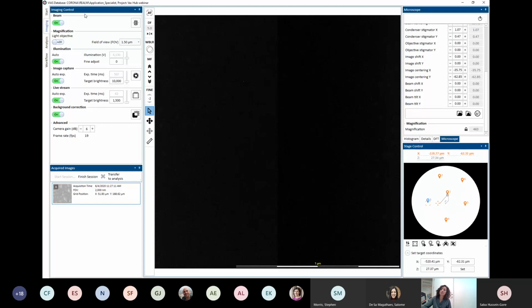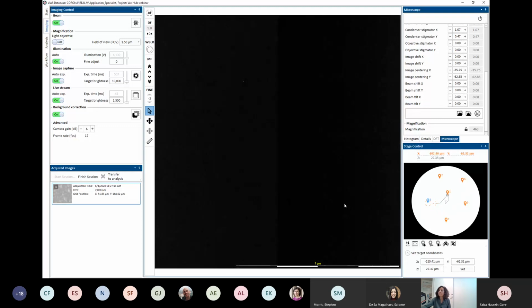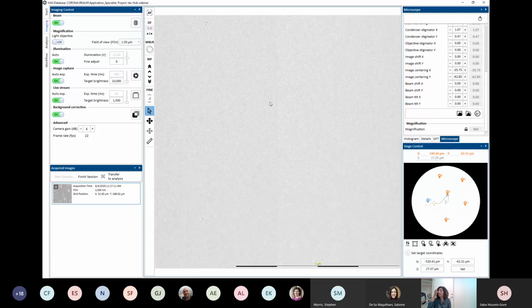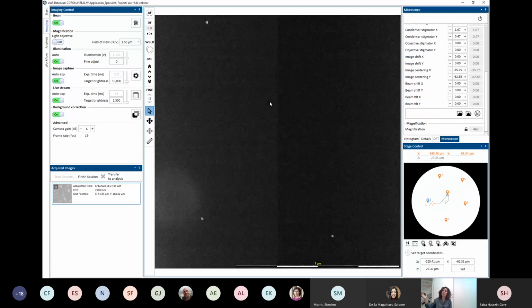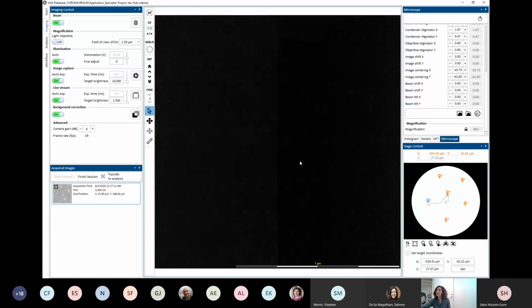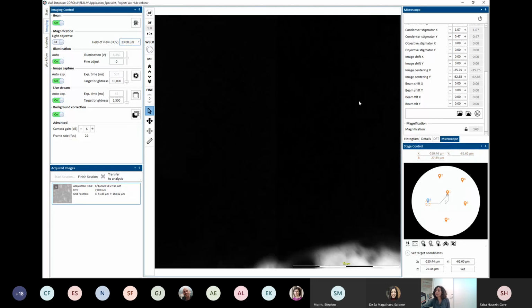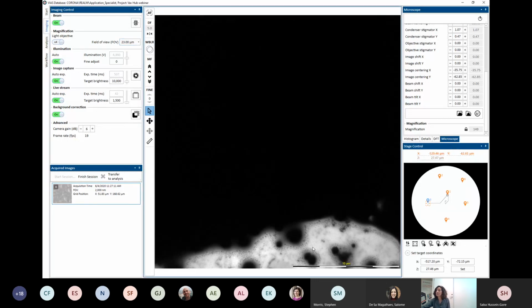Right now, I was pretty zoomed in when moving across the grid, and that might make it a bit slower. Perhaps I should have zoomed out and then it could have gone a little bit faster, because now it's in high magnification, but that's fine. So this was the wonderful area that I chose, but I can zoom out and see, is it really that bad? Am I on a grid square? Probably am. I'm going to zoom out even more. I was.